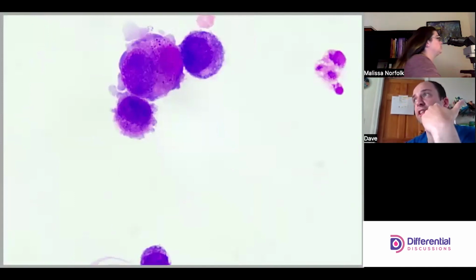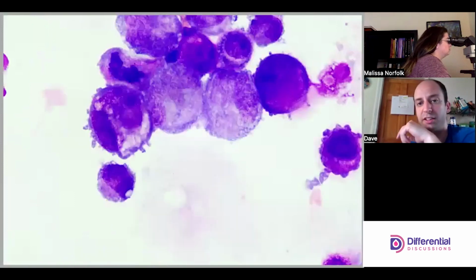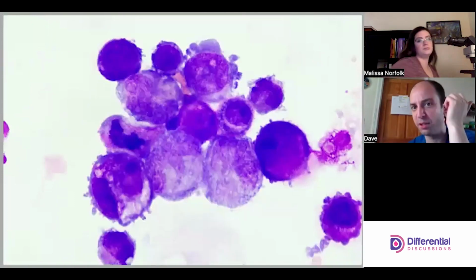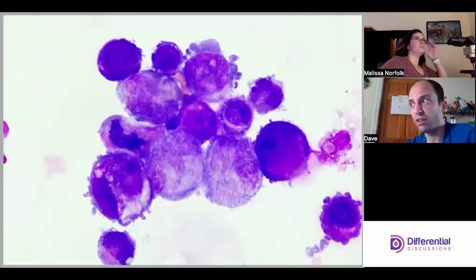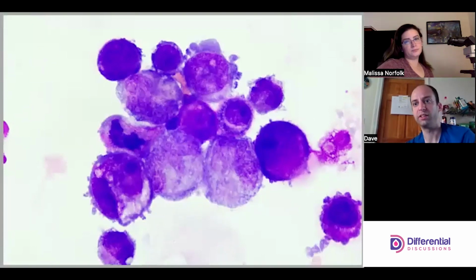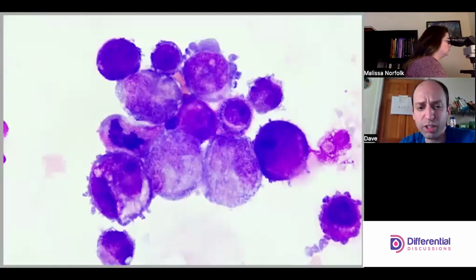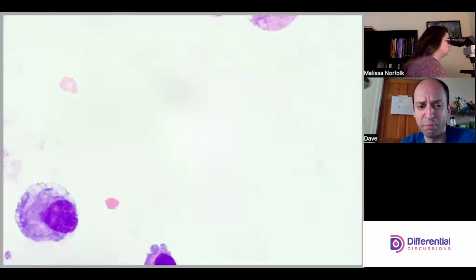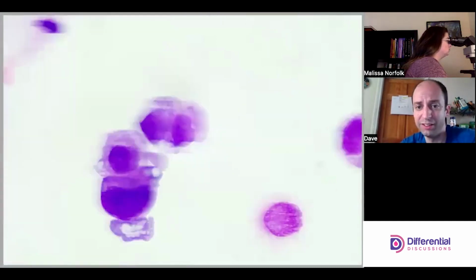There's a saying I throw around a lot: birds of a feather. And you might start to see that maybe there are several different populations of cancer cell here. Well, that's not unheard of either. Cancer cells' genomes are anything but stable. So it's not crazy at all to start to see that as it progresses. I'm not in the business of doing medicine, but this looks like very, very advanced disease.